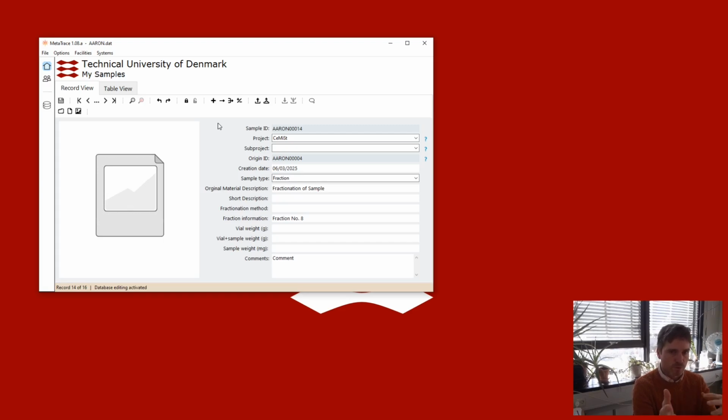So we lose that connection. Another thing is that if we deleted a record, then those unique IDs would shift. You could have an idea with this, all the records higher than the one we deleted, their ID would then shift lower, so it would complete that sequence of record number 1 to record number at the end, basically.